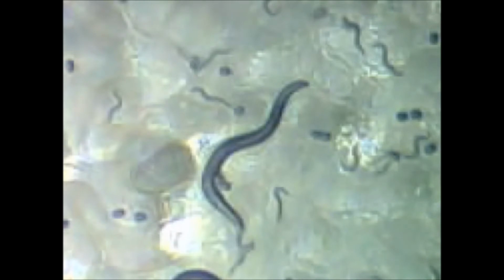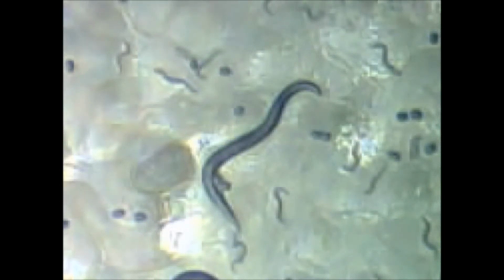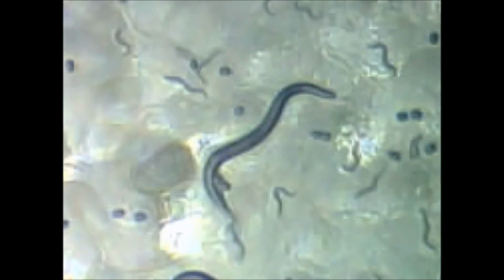Here is another example of a worm whose UNC22 gene has been suppressed. As you can see, its head is twitching as it struggles to move.